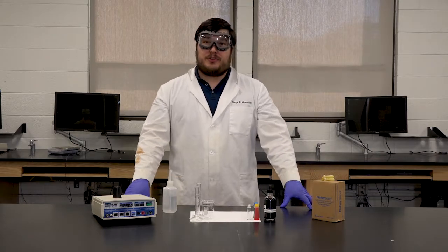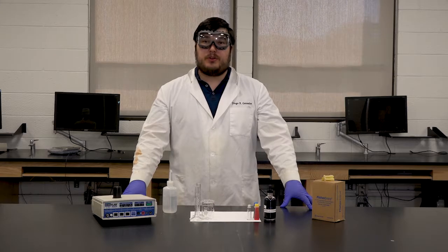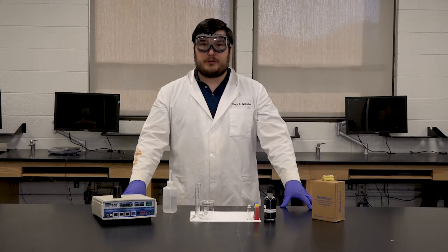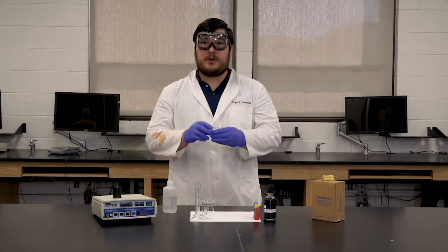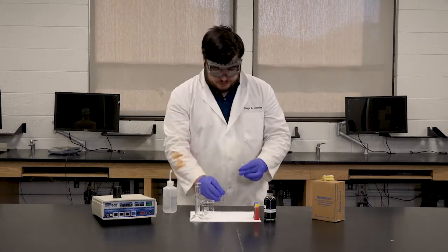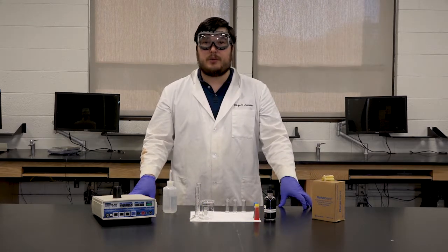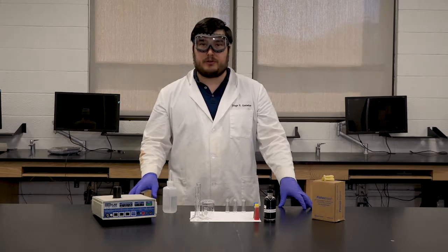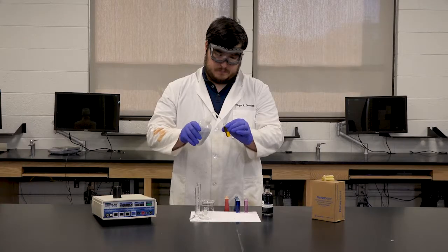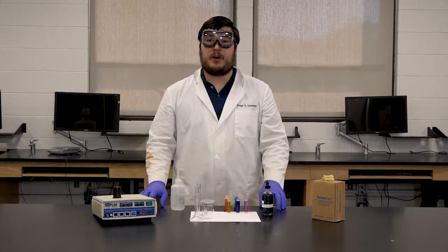While we wait for the spectrophotometer to blank, we can take this time to go ahead and make our solutions for part 1. To do this, we're going to need 3 vials, so let me go ahead and get some more. With these 3 vials, we're going to make a solution of the individual colors on their own. One of the purple, one of the blue, and one of the yellow. We're going to add 1 drop of these and fill the rest with deionized water to make our solution. Now with these solutions made, we're ready to begin part 1 of the experiment.